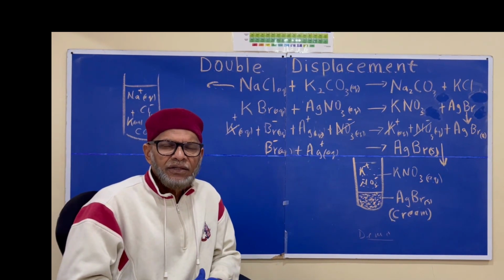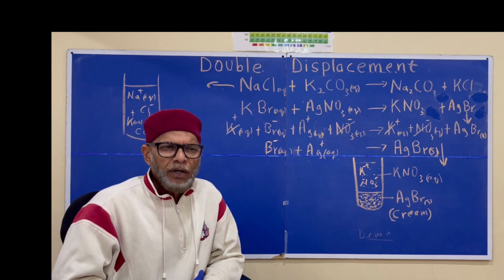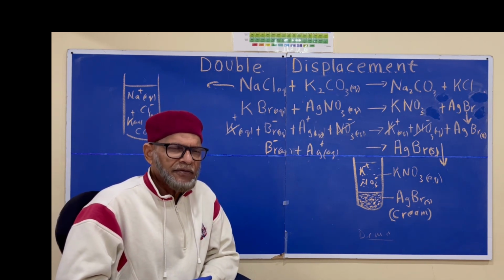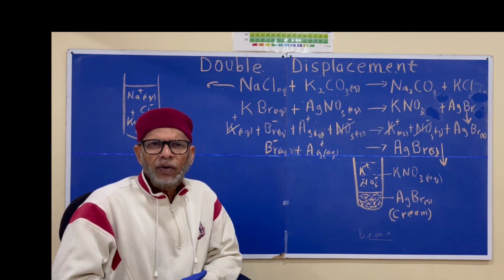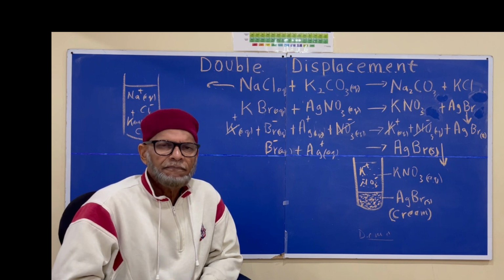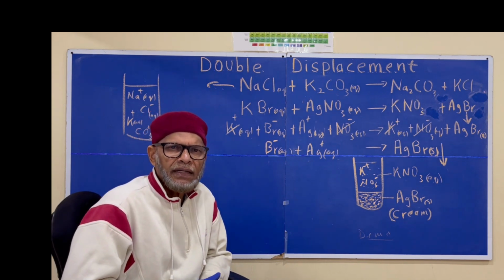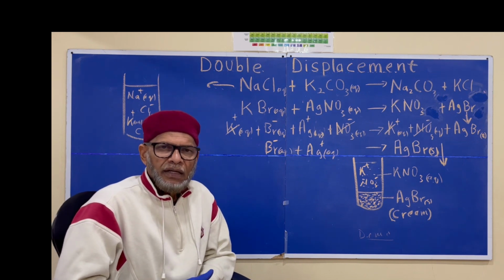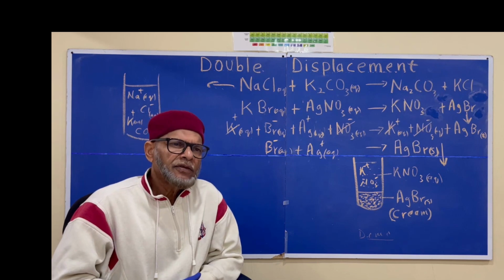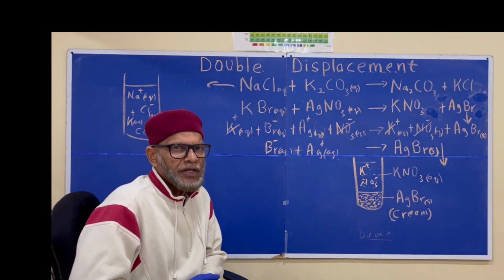Hi folks, today we want to revisit double displacement reactions with the objective of learning how to accurately predict if such types of reactions will happen when two aqueous solutions of different ionic compounds are mixed together. Recall that one of the ways of identifying a double displacement reaction is when a precipitate is formed. However, there are other types of double displacement reactions that do not involve precipitate formation.